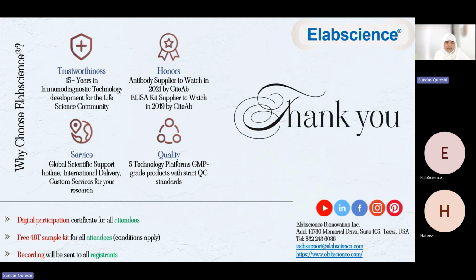Can TOS and TAS be used to compare the oxidative stress levels across different experimental models or species? I have mentioned this in my presentation as well. And yes, because TOS and TAS reflect a global oxidant and antioxidant status, they are well suited for comparative studies across cell lines, tissues, animal models, and even clinical samples, provided the sample preparation and normalization strategies are consistent.